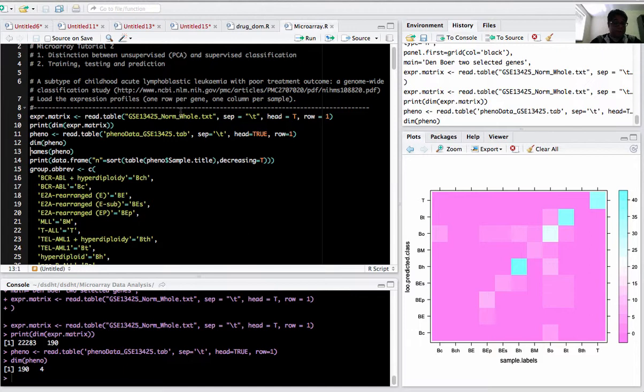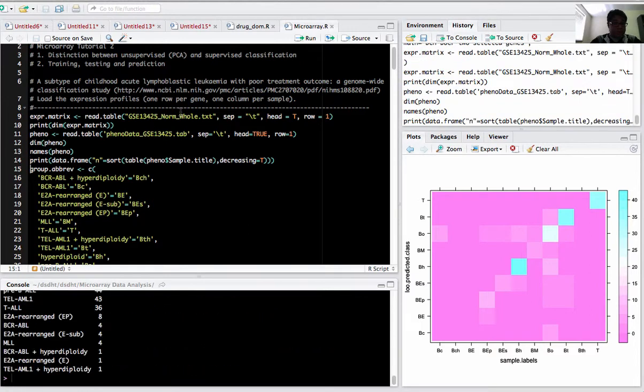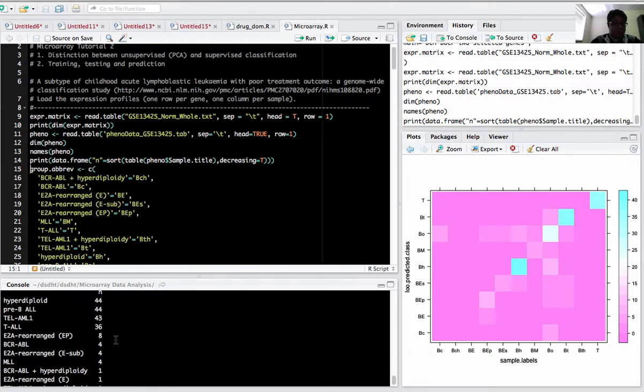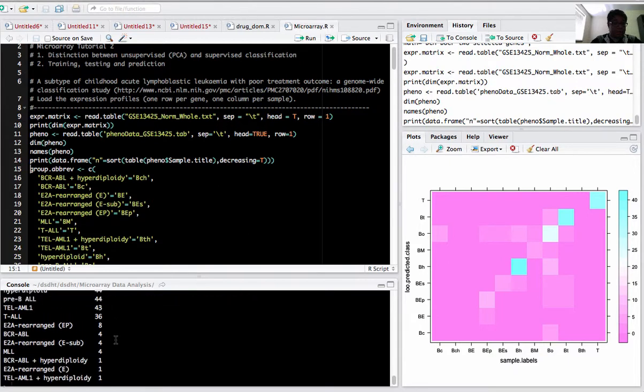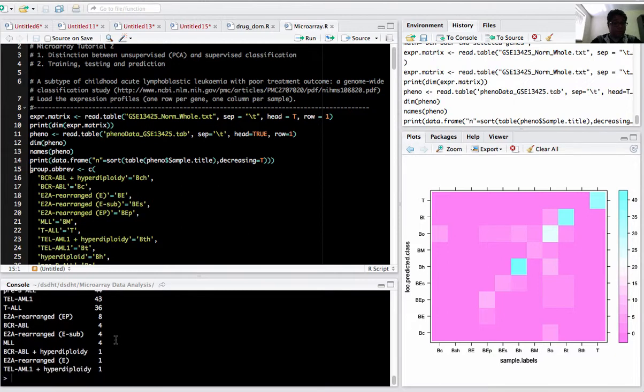The pheno data has sample title, sample source name, sample description, sample characteristics. The samples have been grouped into 11 different categories. The 190 samples include 44 patients with hyperdiploid, 44 patients with pre-B ALL, T-ALL has 43 patients, and so on.